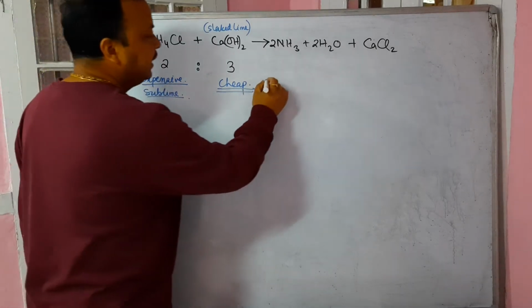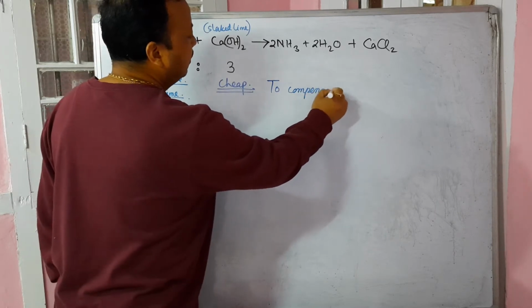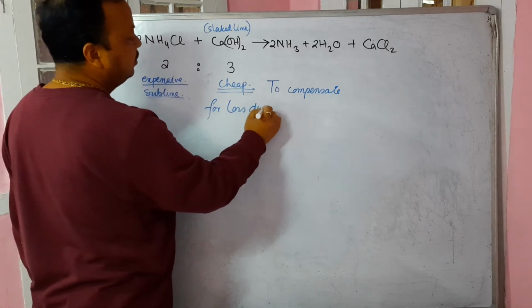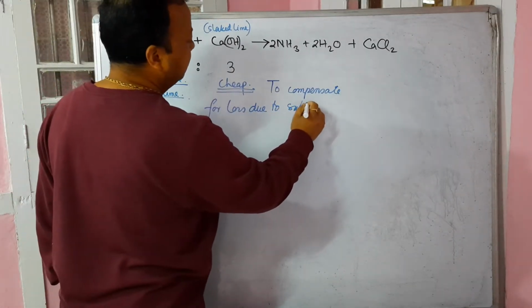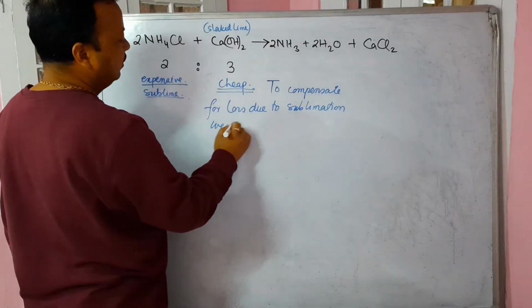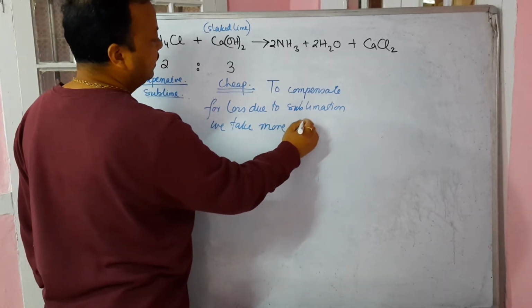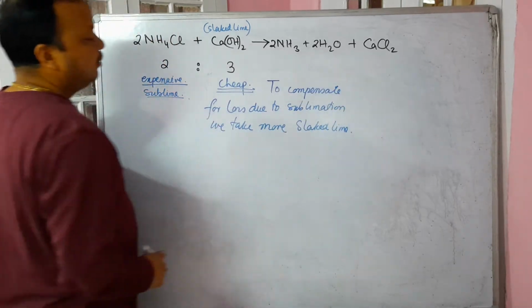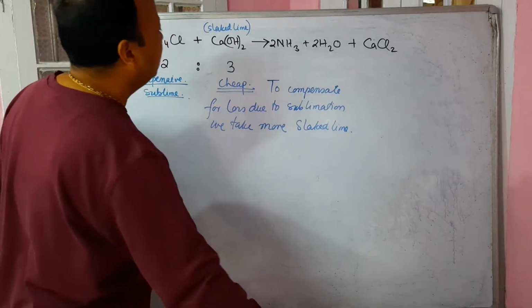No, to compensate for loss due to sublimation, we take more slaked lime. So for the reaction to continue, we can take any one of them as higher.